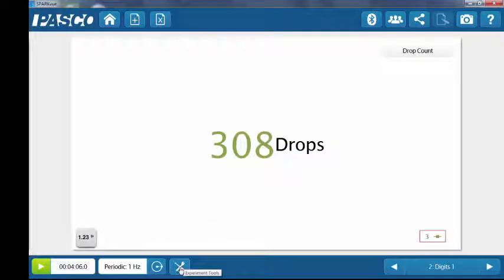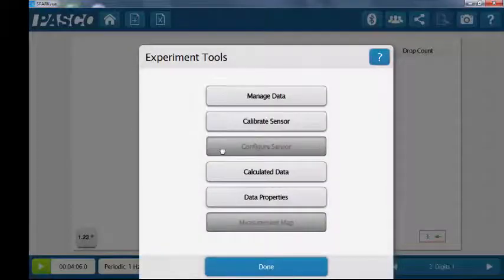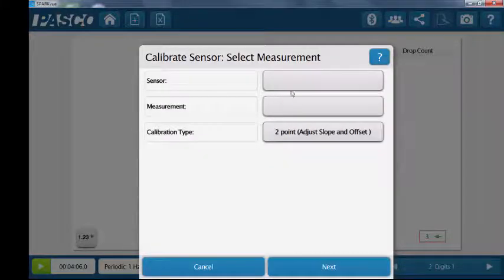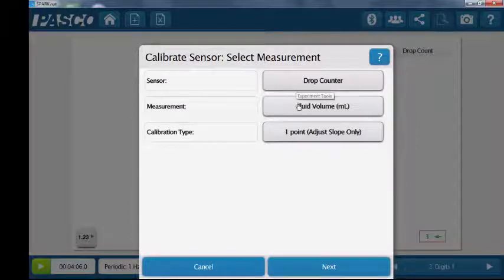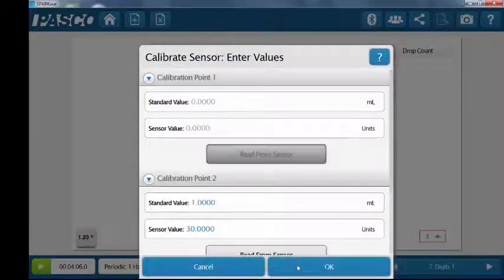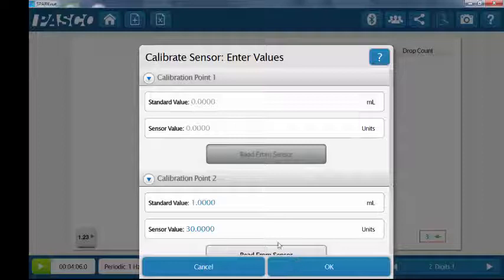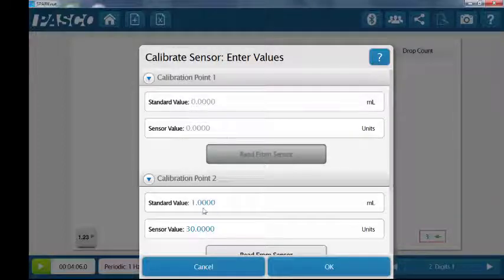To enter your calibration data, simply go to the experiment tools button. Click on calibrate sensor. Change the sensor to drop counter if needed. Click next. Calibration point 1 is automatically set to the default value of 0.